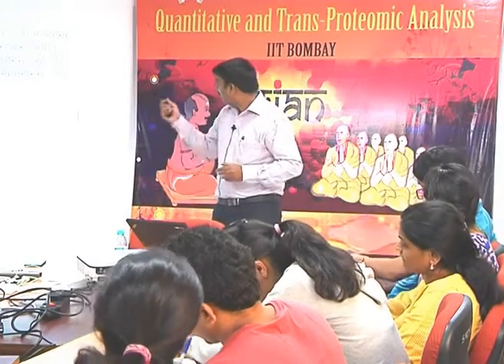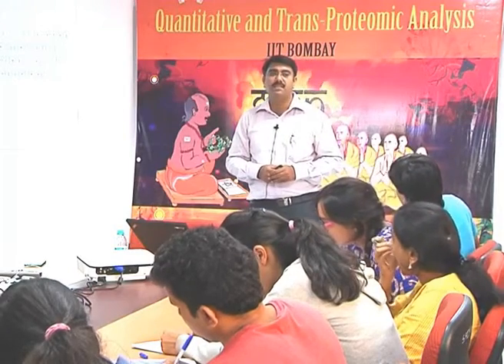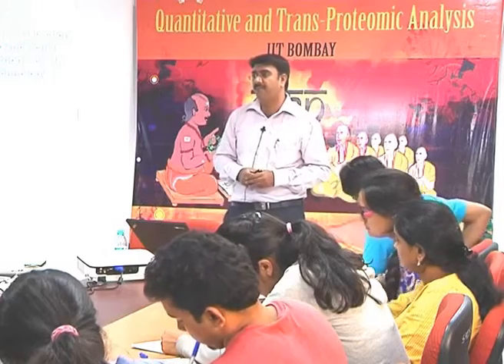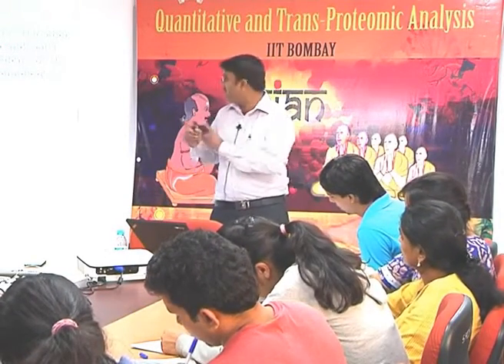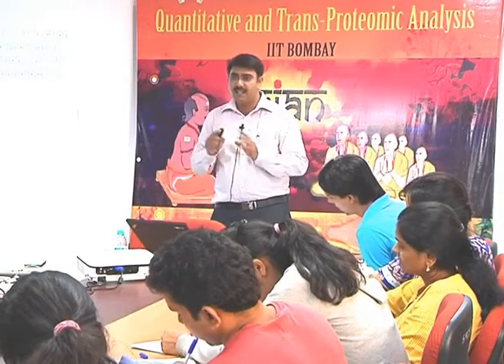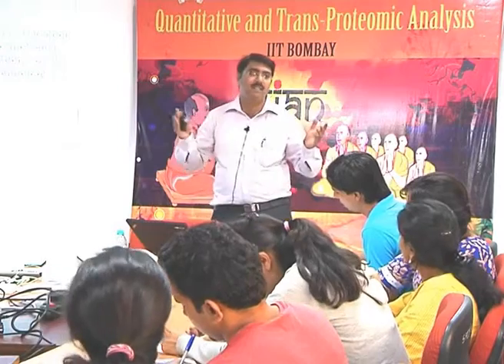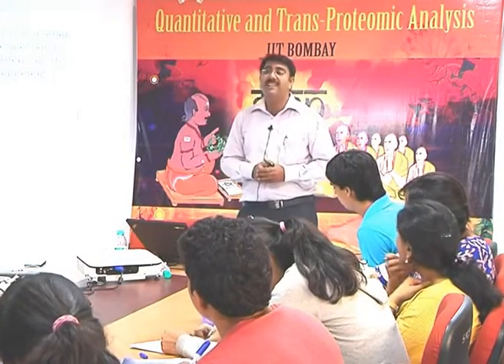I am going to discuss what exactly this BLI technology is. BLI is nothing but biolayer interferometry. SPR technology is surface plasmon resonance. Here we have the BLI technology. The technologies are different, but the output from SPR or from BLI is the same. So how exactly does this technology work?